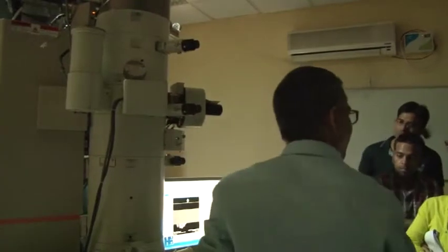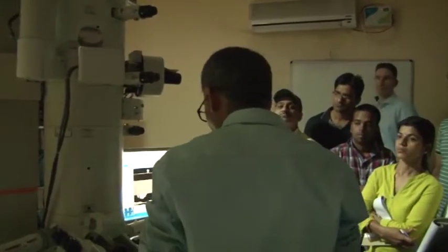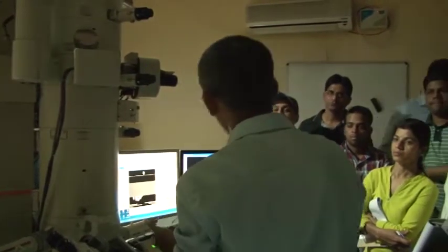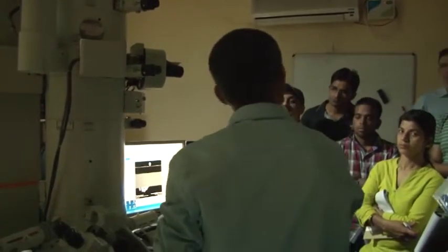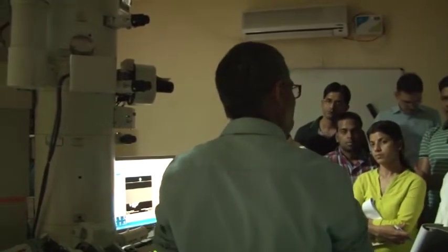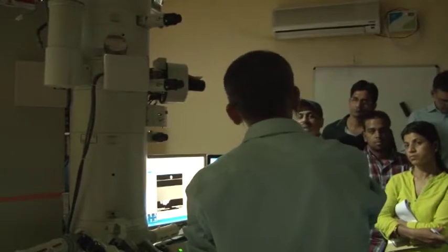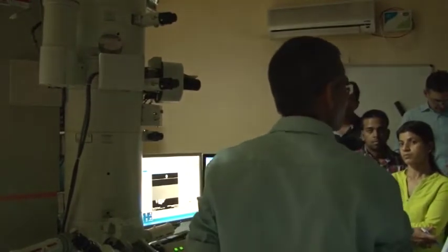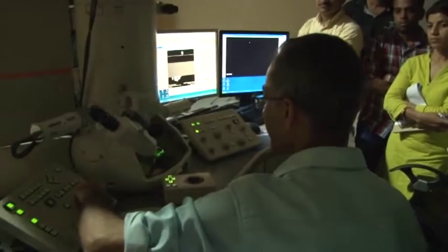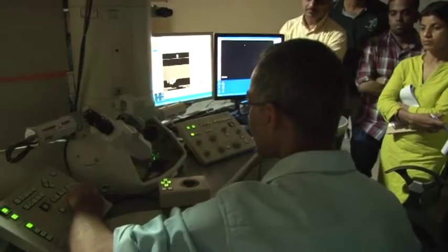Whenever you correct it, let us say I am maybe under focus, and I see I need to correct it. You don't correct it fully, you correct it only 90%, because you never know how it is going to be when you go from under focus to over focus. So that's the trick.